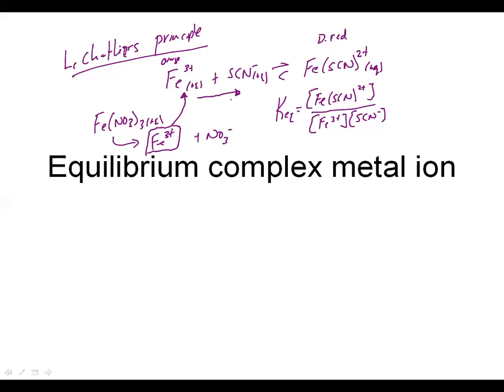So when you think about the reagents, like what we have here, and you think about what you're adding, you want to think about what that reagent is a source of. And just like I did there, if you see that part of that reagent is actually in the equation, then it probably means you're adding that thing. If you see that you added something and nothing is in the equation, but the two sources of whatever you added were not there, then probably what's happening is one of those is able to react with something that's in there.